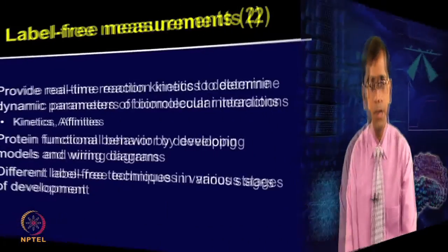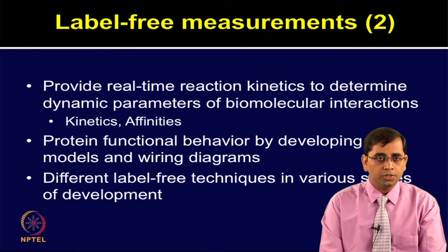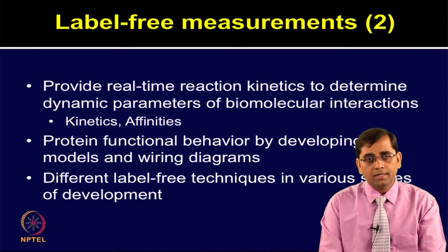As we discussed, the label free measurements have many advantages over label based techniques, and one of the most striking advantages is that they can provide real time reaction kinetics to determine the dynamic properties and parameters of biomolecular interactions.